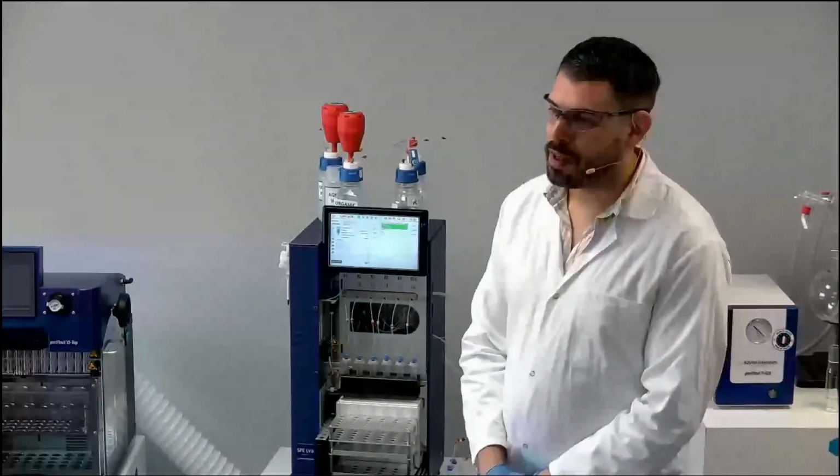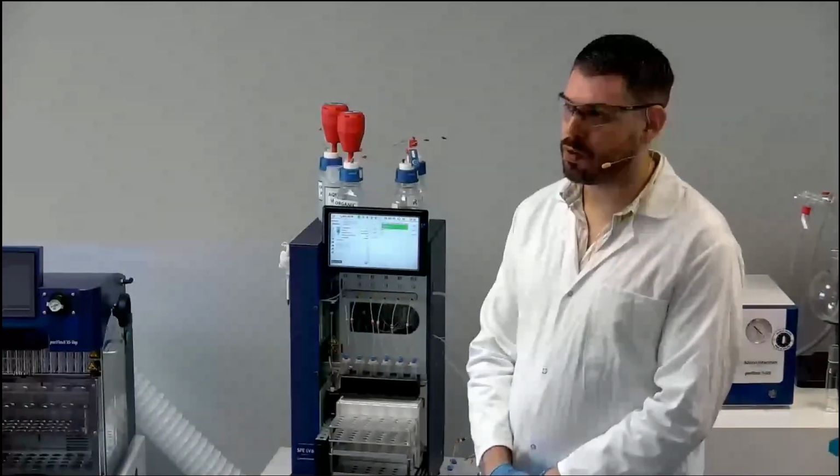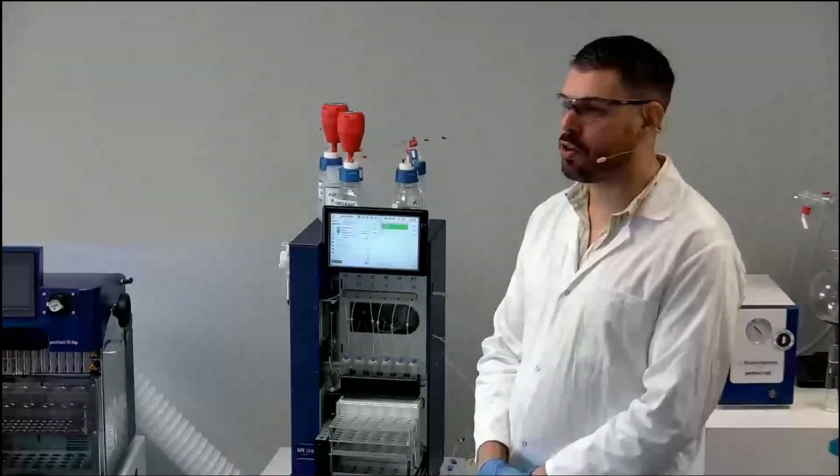We did have another question come in. It says, so it is a positive pressure system, we can say. So what is the max pressure for the cartridge? For the max pressure, we don't have a pressure detector, but it's more about flow rate. The maximum flow rate that you can use for this system is 50 ml per minute, and that can create pressure, which depends on the sorbent.